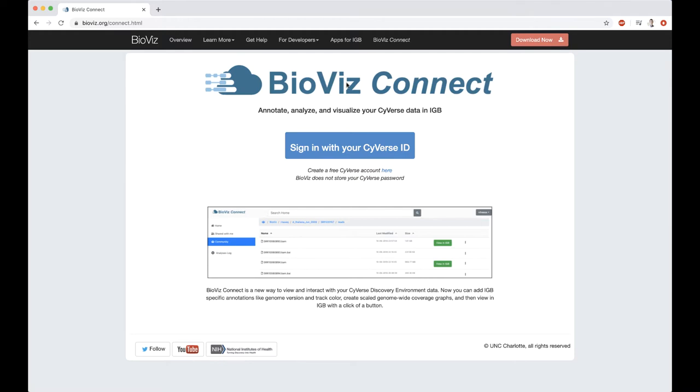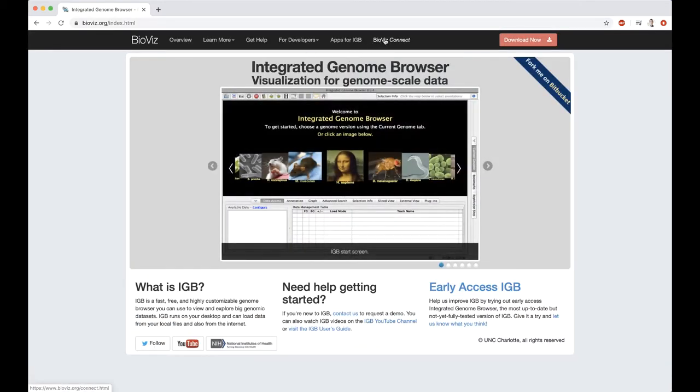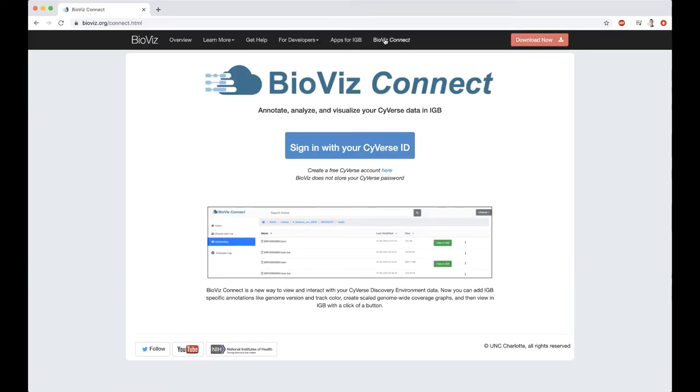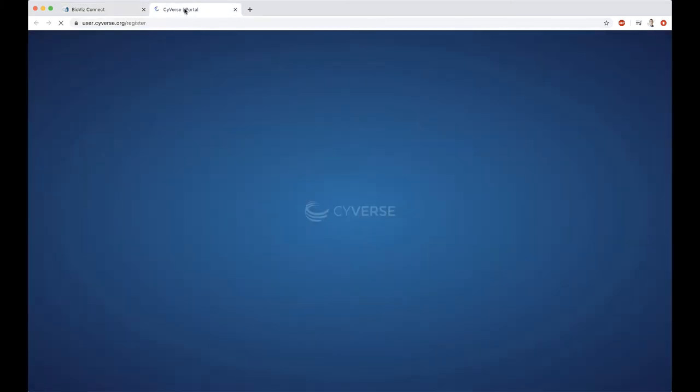To access BioVizConnect, go to bioviz.org slash connect.HTML. You can also get here just from bioviz.org by clicking on BioVizConnect. To sign in to BioVizConnect, you need to have a Cyverse ID. This is provided free from Cyverse, so you can click here and create a Cyverse account.